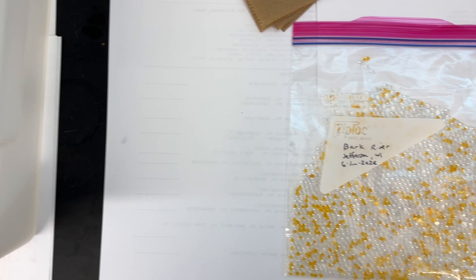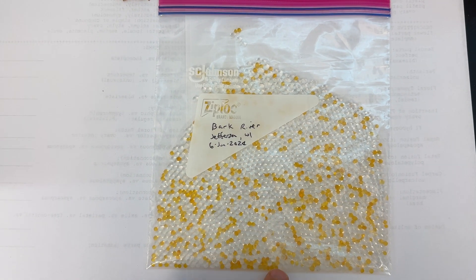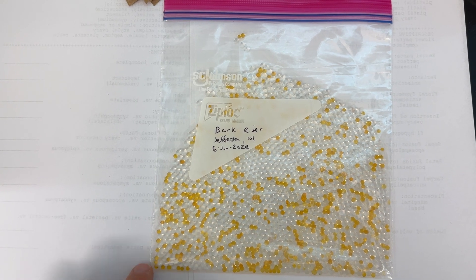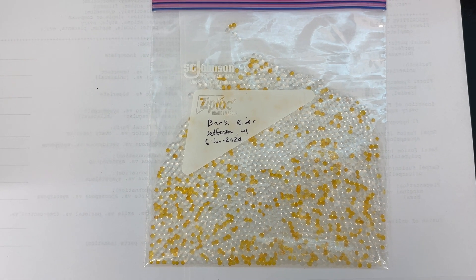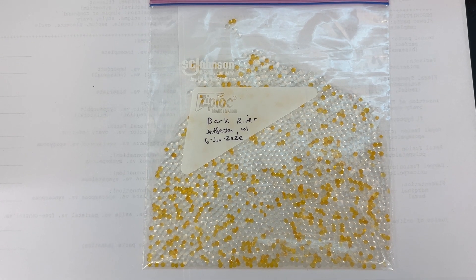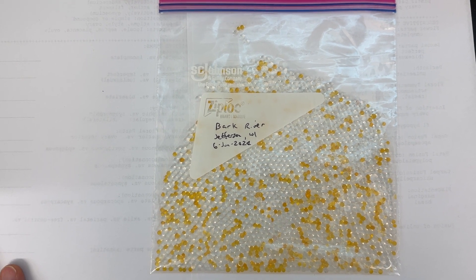The important thing is we're going to dry it out quickly. There's this material called silica gel — this is an indicating type, a mixture of indicating and non-indicating, so it's kind of an amber color. There's another one that's blue, and they change color if they get wet. Silica gel is a desiccant that dries things out fairly quickly, and once dry it keeps material dry — a really nice way to keep stable DNA. Dry material lasts a long time, ships well, and keeps DNA well preserved.